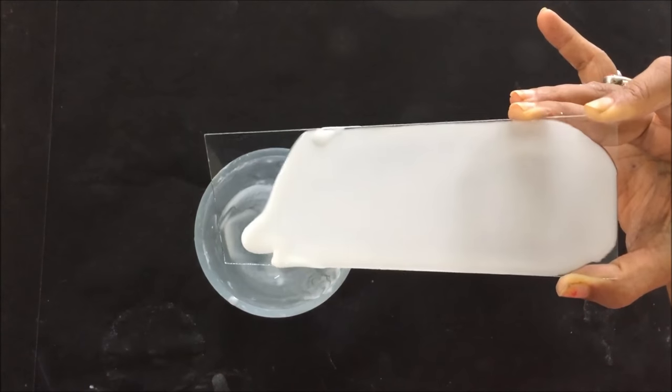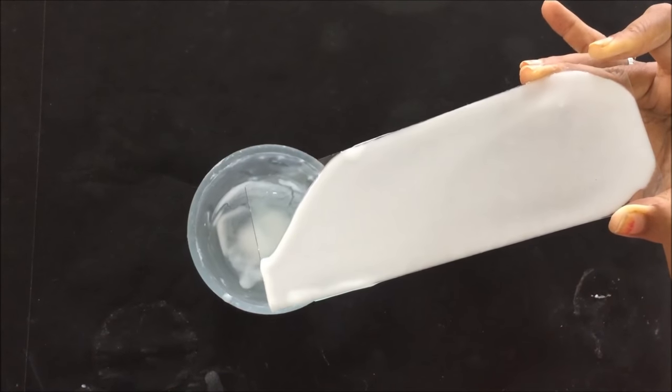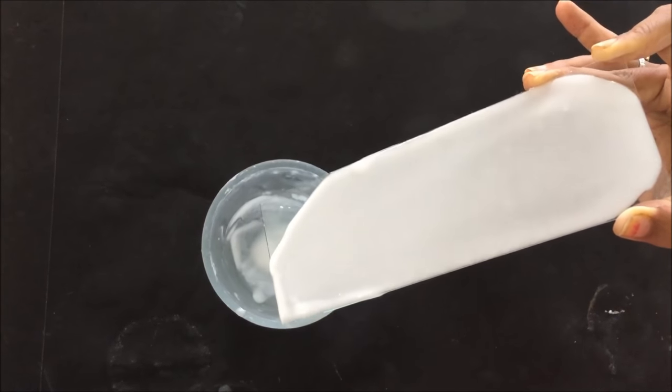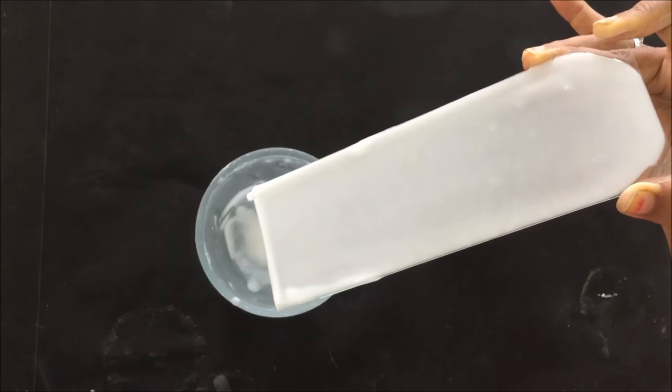Move the glass plate so that the slurry gets uniformly coated over the glass plate. You can see that the slurry is uniformly coated over the glass plate.